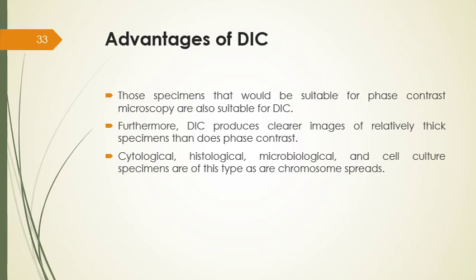So one can easily view the specimen. This microscope will produce very clear images of relatively thick specimens that are not produced by phase contrast microscope. In addition to this, no halo effects occur when we use DIC microscope, and it can be used to produce a very clear image of thick specimens.